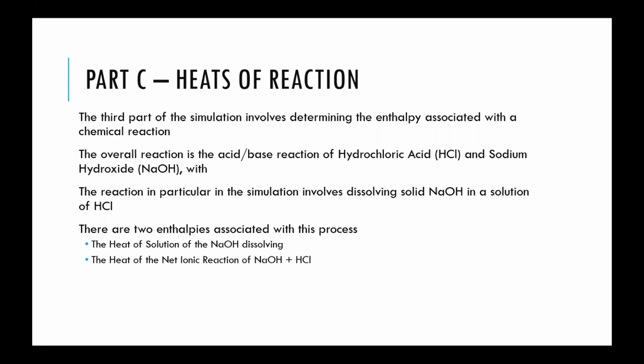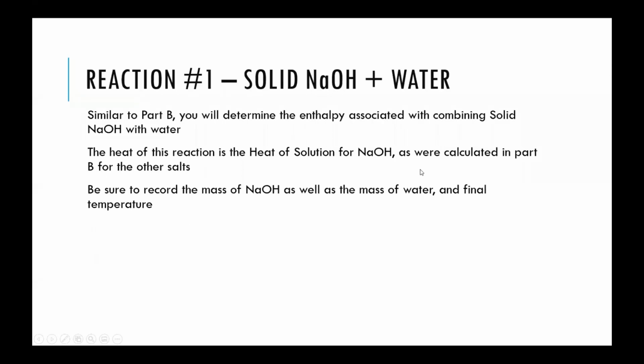The bulk of part 3 looks at the investigation of the acid-base reaction with hydrochloric acid and sodium hydroxide. This will be done in 3 different reactions, each involving 2 separate processes. There is the process of the solid sodium hydroxide actually dissolving, and there's also the process of the hydroxide ions reacting with the acid ions.